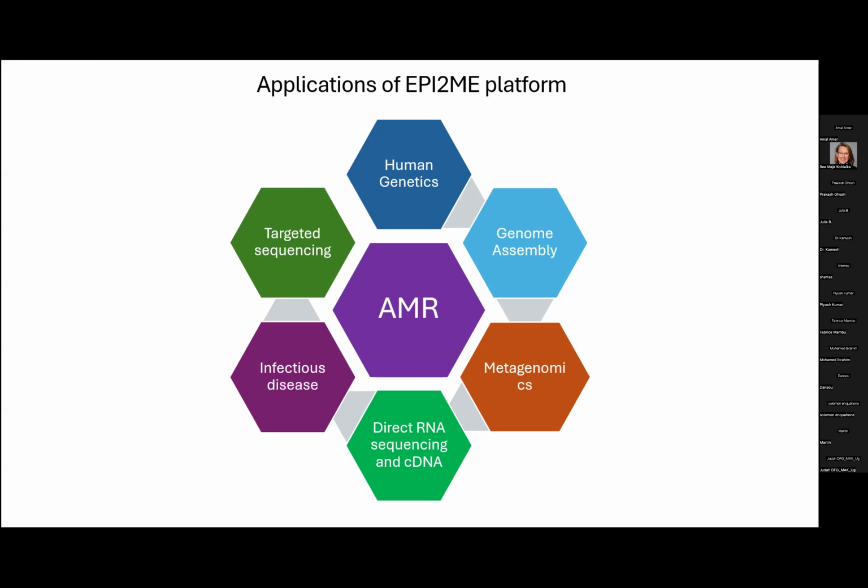So that is the motivation of our study, and therefore we are going to share our experience of how this new workflow is working, and so far what we have done.